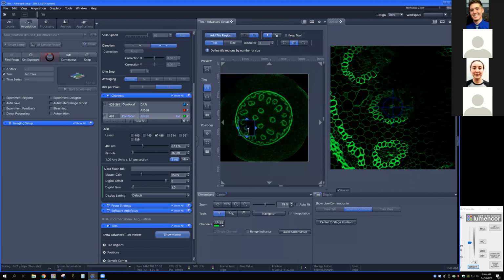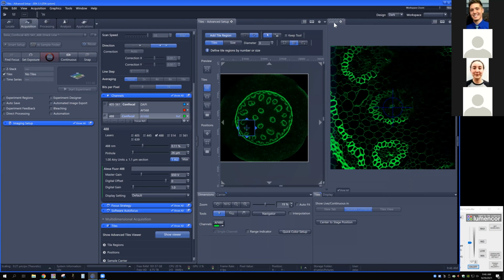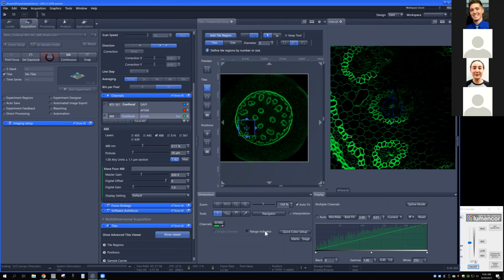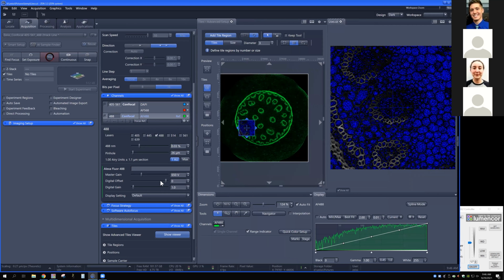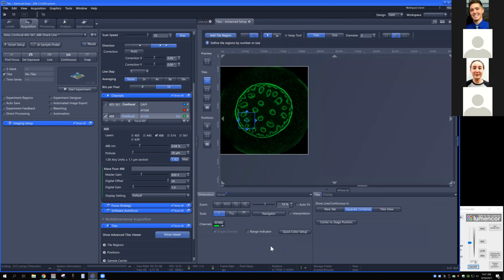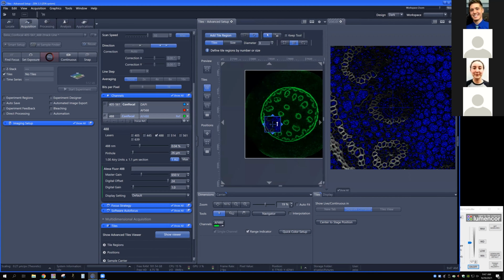And so from here, this can be quite helpful because, oops, not that one. You need to remember to activate the right window here. Jeez, so sensitive. Very nice. So we can basically jump around and look for different spots. So let's do that as we look at different types of tile regions as well.